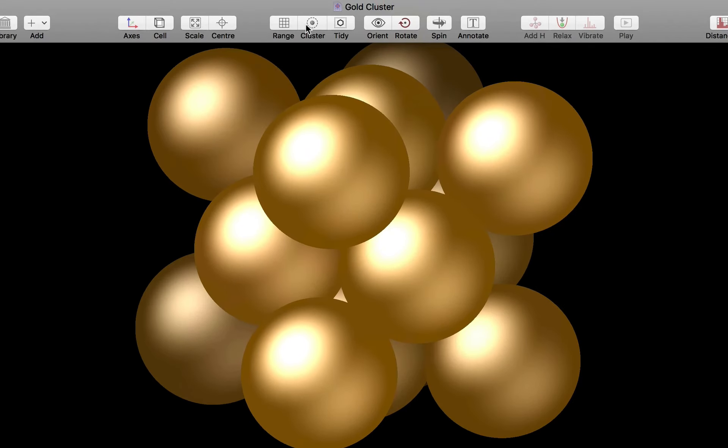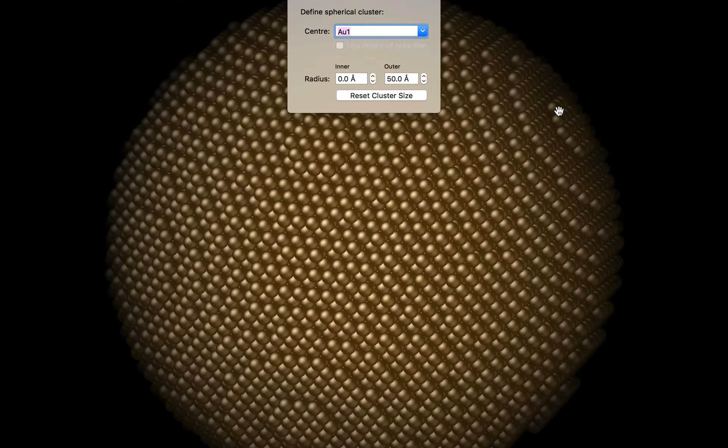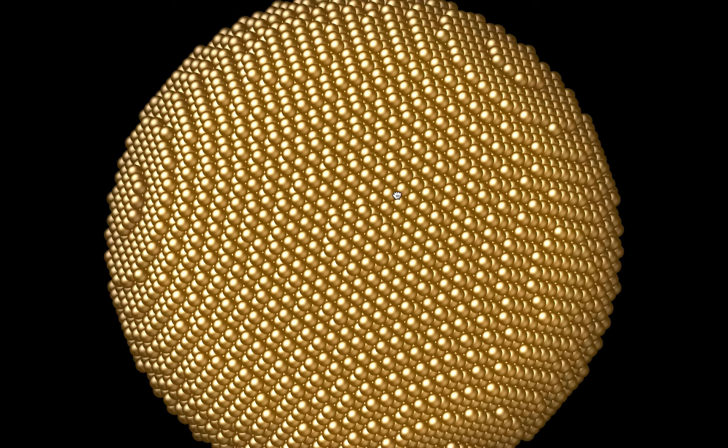So we'll go to the cluster command and then we need to enter the size of our cluster. We have a 50 angstrom cluster that we'll define. This is the radius that will make the actual size of the cluster diameter 100 angstroms. So here is our 100 angstrom nanoparticle of gold.